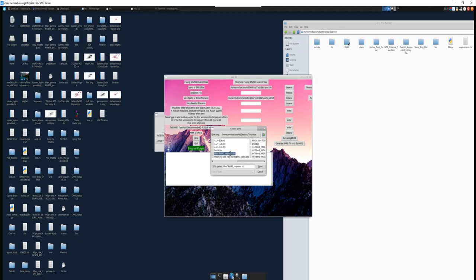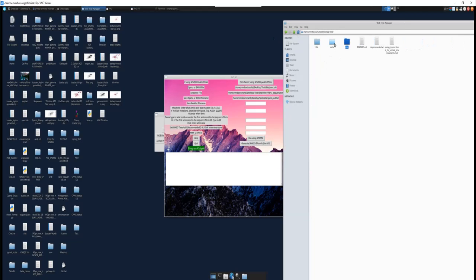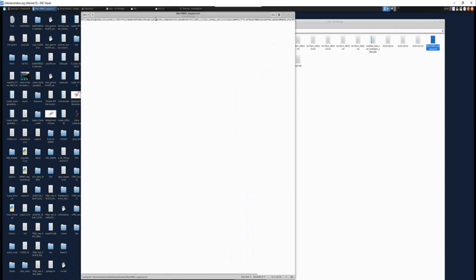So I have a sequence file here, and it should be important to note the format of this sequence file. If I go here and open up the sequence file, yeah, it's over here. It should be single letter abbreviation, and it should be just one single line. So no spaces and no line breaks. And if you have any mutations here, you can input them.